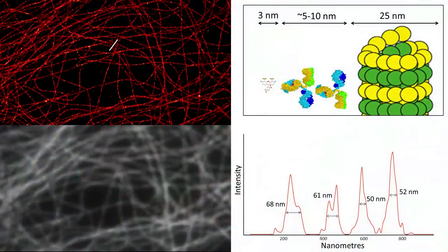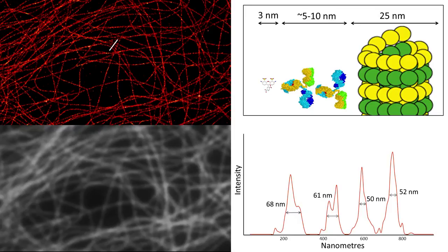Here we have a zoomed in section of the final super resolution image and the same area from the epifluorescence image for comparison. The gain in resolution is clear as you can see from the cross sections of microtubules which are well inside the diffraction limit at around 50 to 60 nanometers. This is about right once the width of the microtubule, the size of the immunolabels and the localization precision are taken into account.